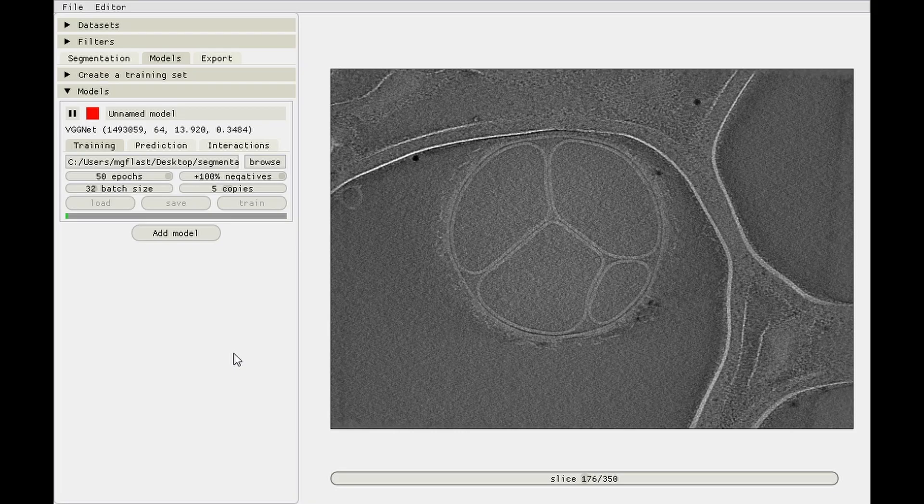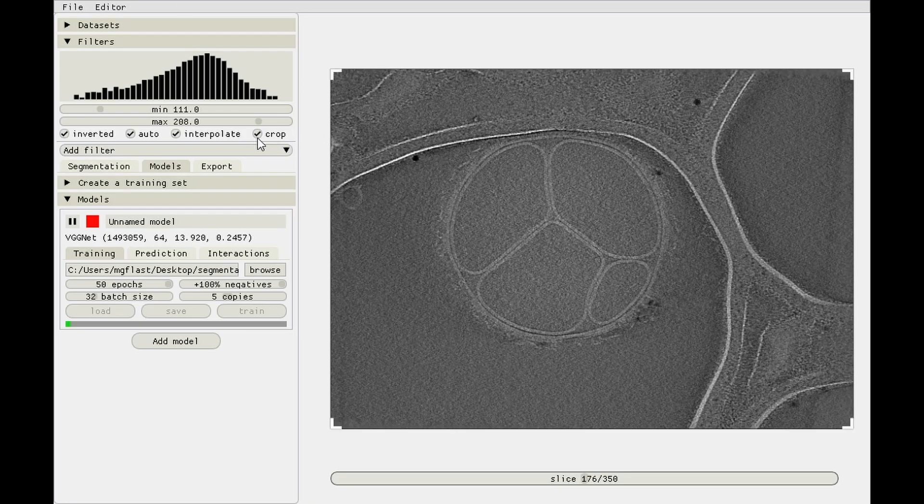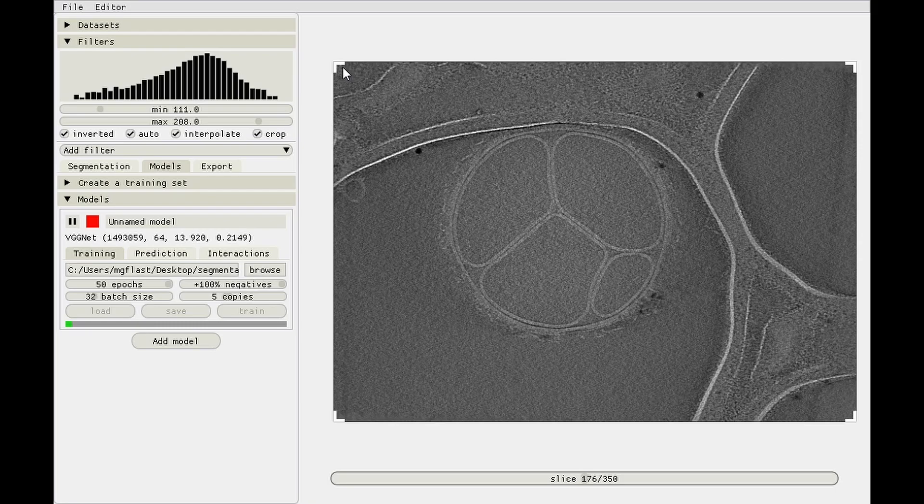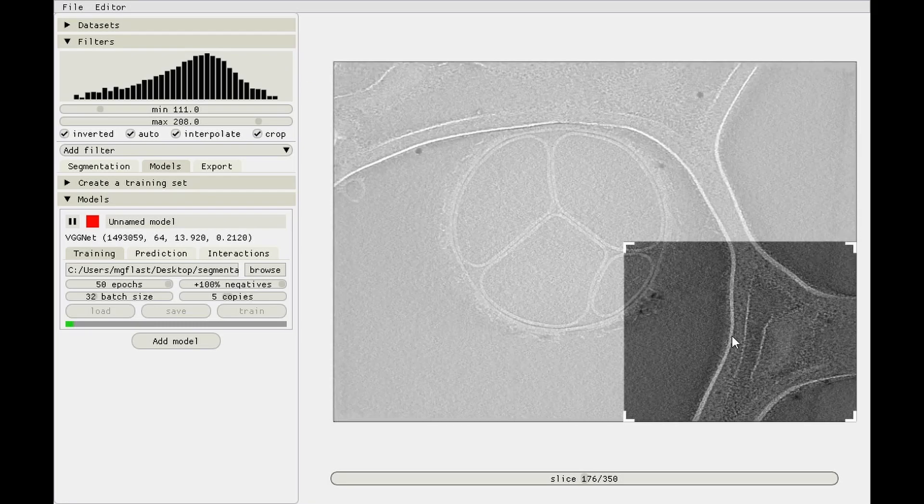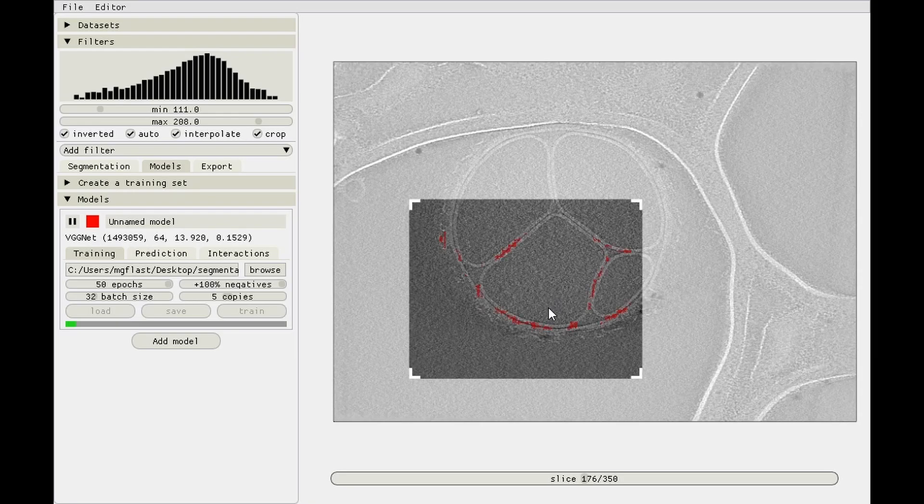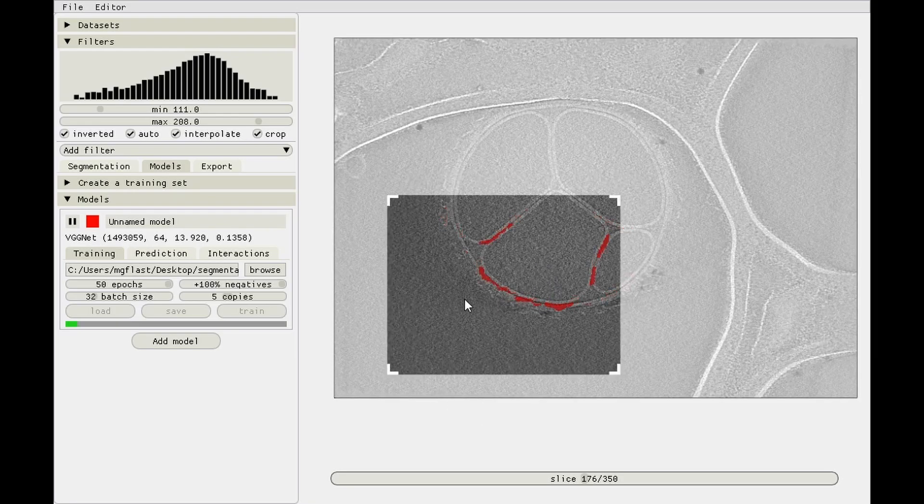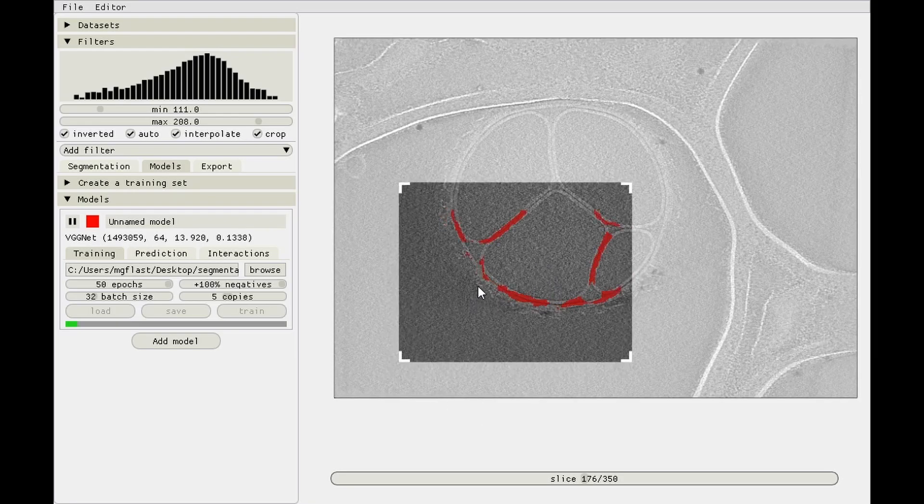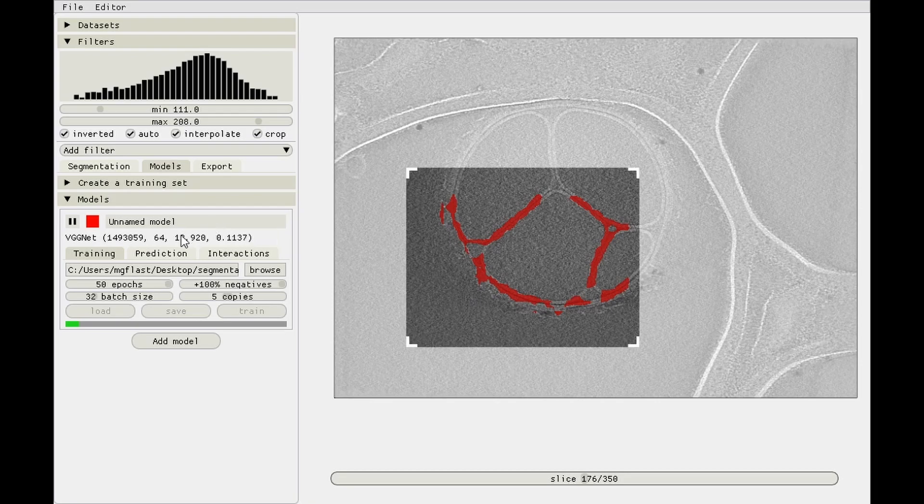Now obviously it's going to be a little bit slower than the UNet Deep from the previous video, because it's a slightly larger model that actually predicts faster than UNet Deep because of the architecture, and also because the training dataset is a lot bigger. I mentioned that during training you can see the model's prediction results progressively get better. Let's do so by cropping this frame and selecting a bit of interest just to make it a bit faster.